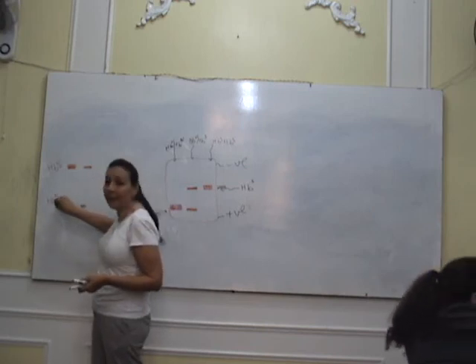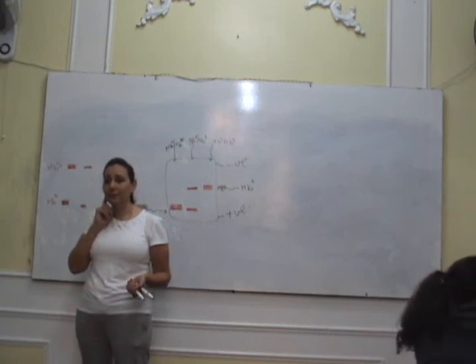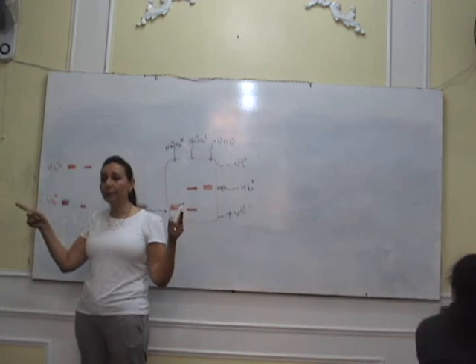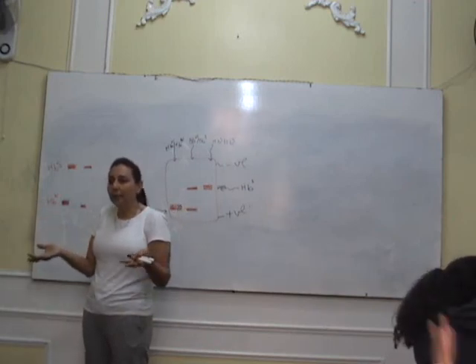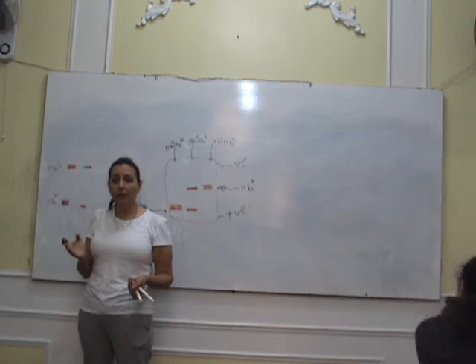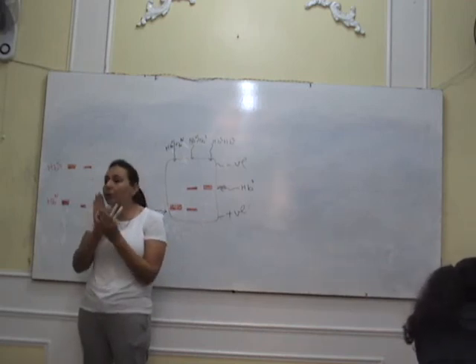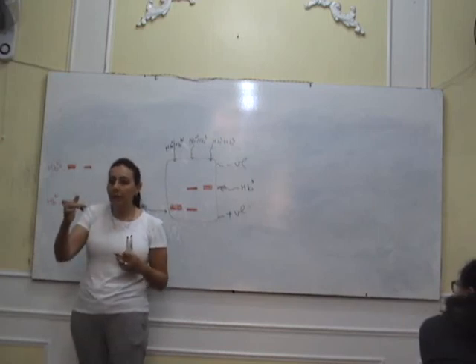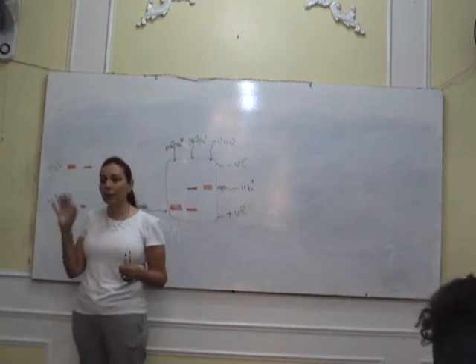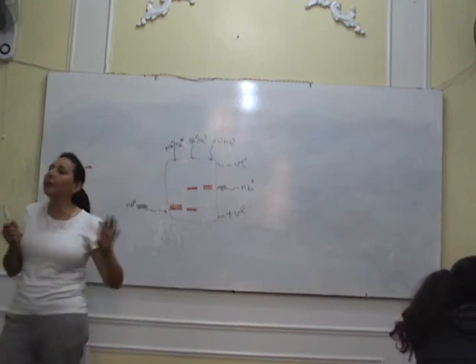عشان اكمل، اتش بي ان واتش بي اس. انا قلت السايز مختلفة، انا قلت تشارجز مختلفة، فعشان كده they move differently. انا قلت ال HBS عليه less charges لان one of the amino acids has no charges. ال HBS، الهيموجلوبين بتاعه the sickle hemoglobin has less charges than the normal hemoglobin.